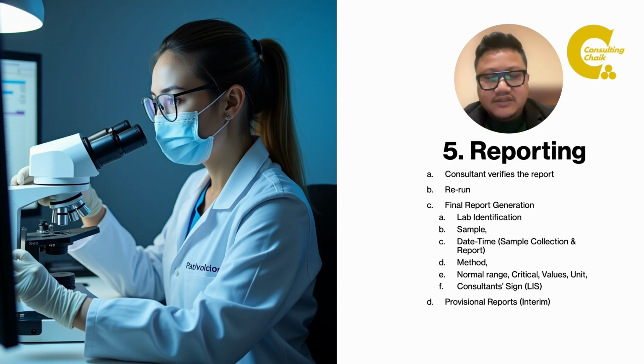If you do this, then the system automatically captures the turnaround time, and you can have a small check box for whether it is a routine sample or an urgent sample. Then you have to write the method as per the test, the parameters, the normal range, and the critical value.